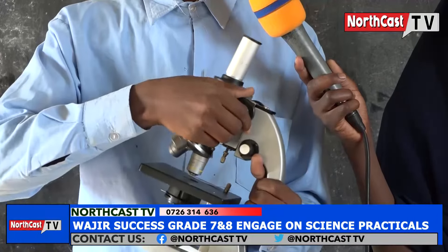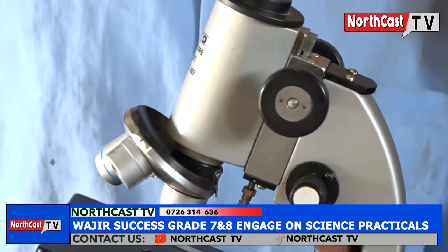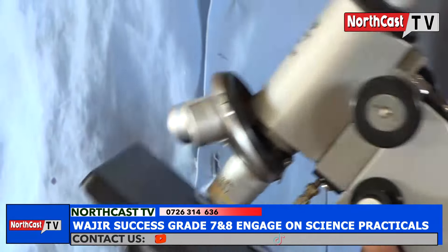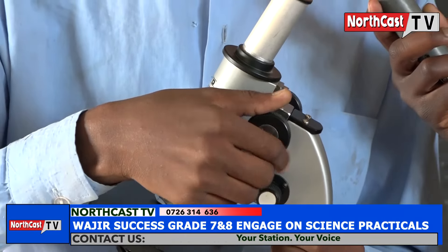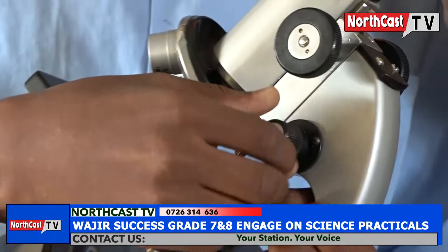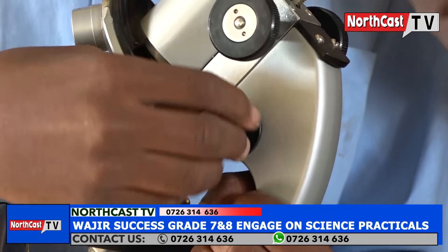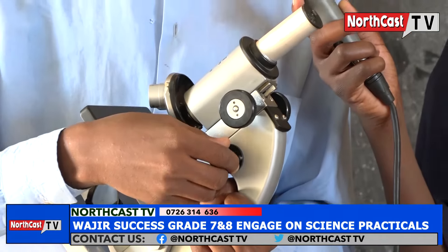The other one is the coarse adjustment knob. The coarse adjustment knob brings the image into a rough focus by raising and lowering the body tube through a longer distance. The last one is the fine adjustment knob. The fine adjustment knob brings the image into a sharp focus by raising and lowering the body tube slowly over a short distance.